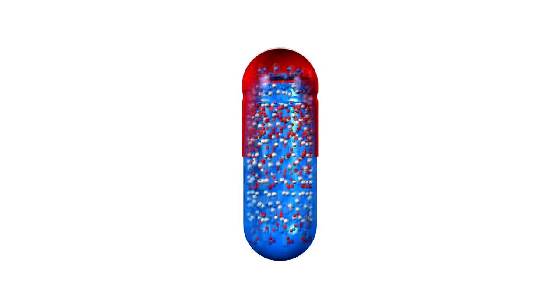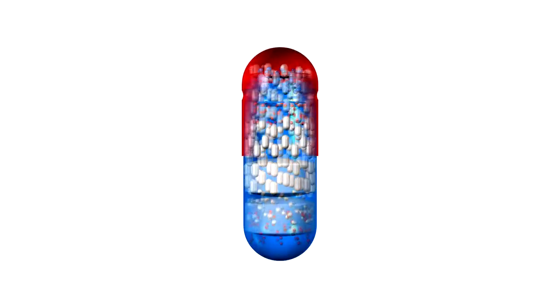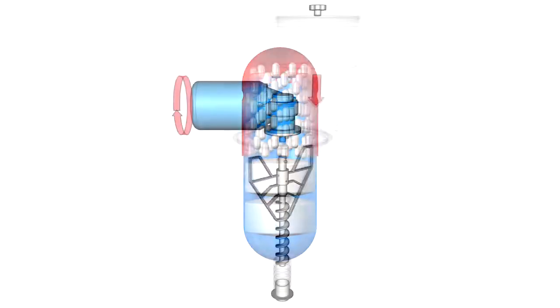This machine can fill various powder, pellet, tablets into capsules while filling various capsules such as pellet powder capsules and tablet powder capsules.